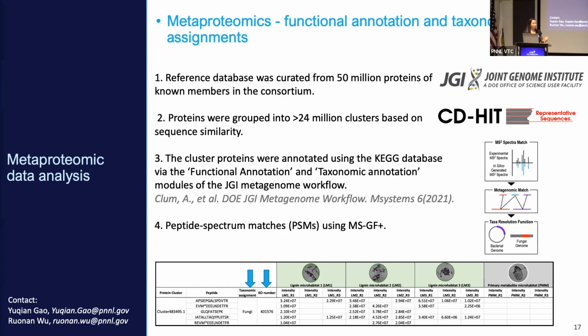After that, we did some further filtering and kept only peptides that had an FDR of less than 1%. Then we did another filtering step, keeping the peptides that are unique. Each cluster had to contain 2 unique peptides, and each peptide had to be detected in at least 2 replicates. That was our further criteria to filter out some results.